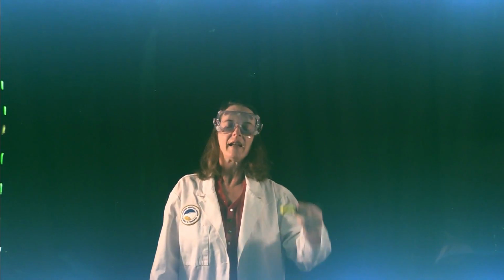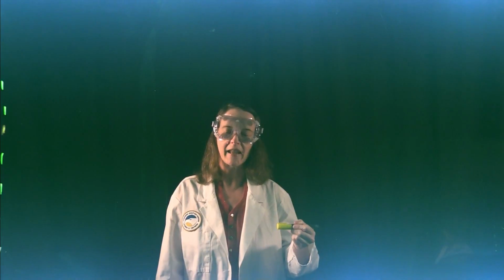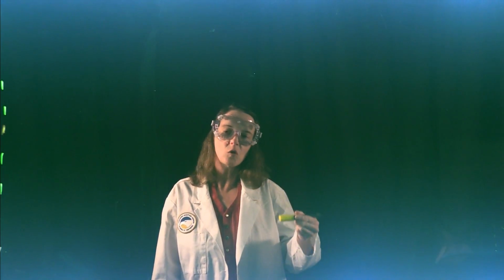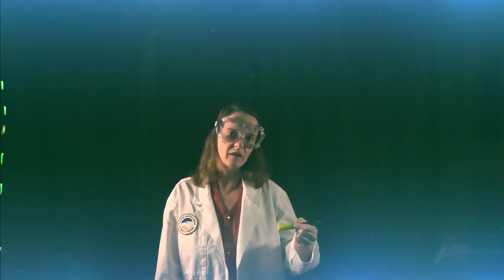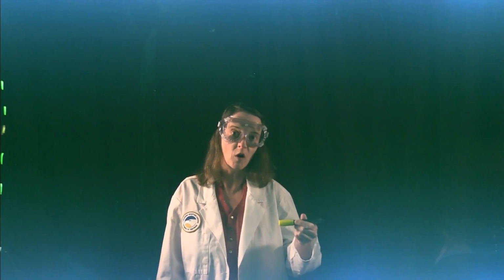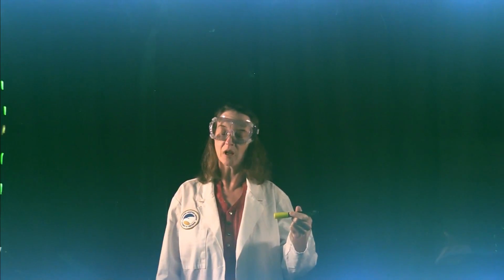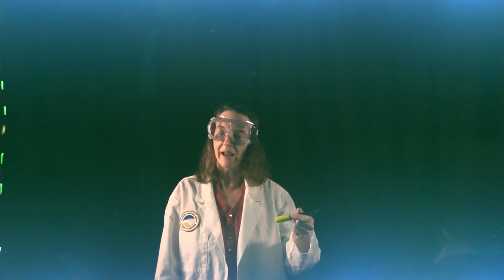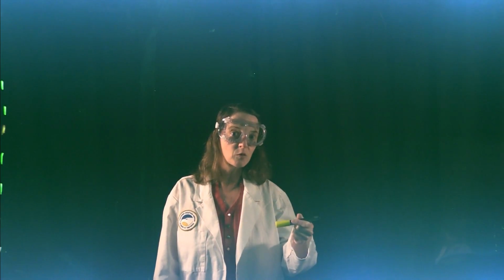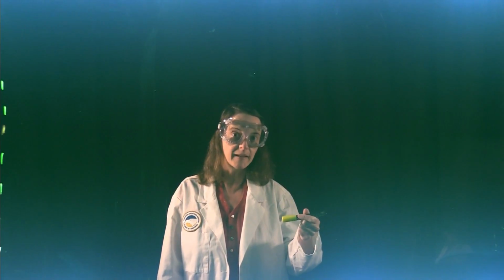Today's topic: atomic absorption spectroscopy and hard water analysis. You're going to analyze a tap water sample for hard water ions. Calcium and magnesium are both hard water ions. We're going to have two atomic absorption spectrometers set up, one of them ready for you to analyze for calcium, and the other one will be ready for you to analyze for magnesium.